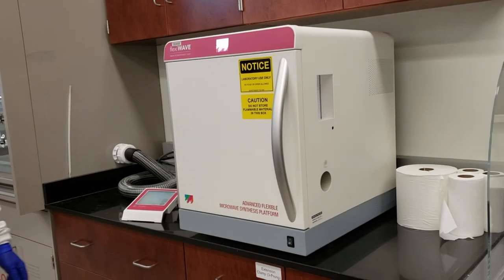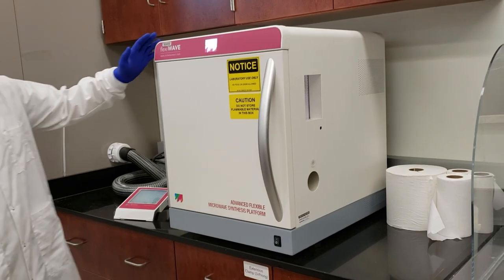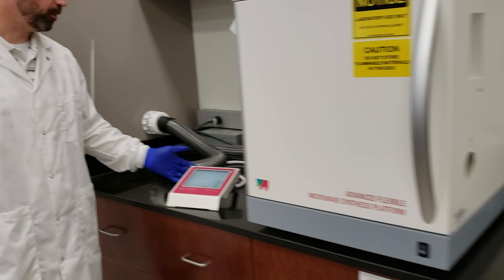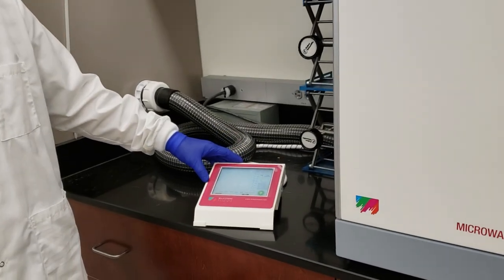All right, so let's take a look at our microwave instrument. This is our FlexiWave from Milestone. A couple of points of interest here. We have our control panel. This is where we're going to set the parameters for each experiment.